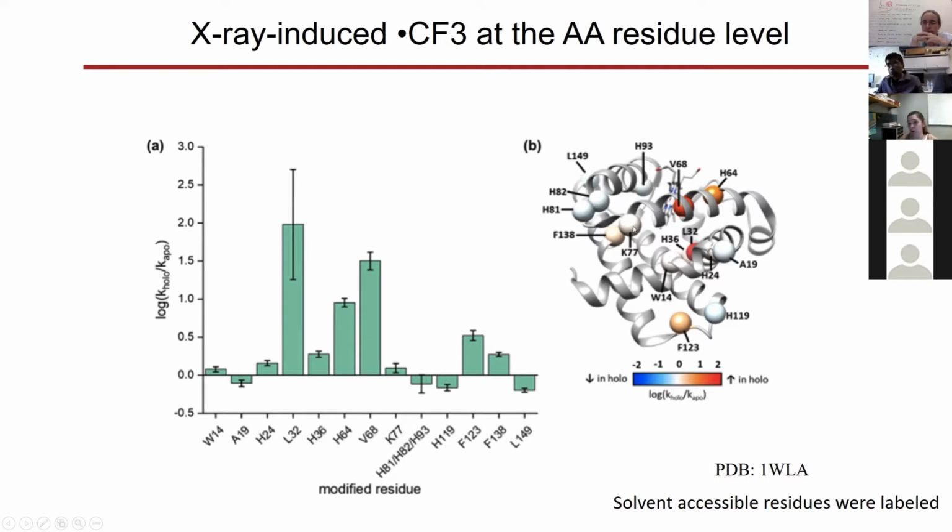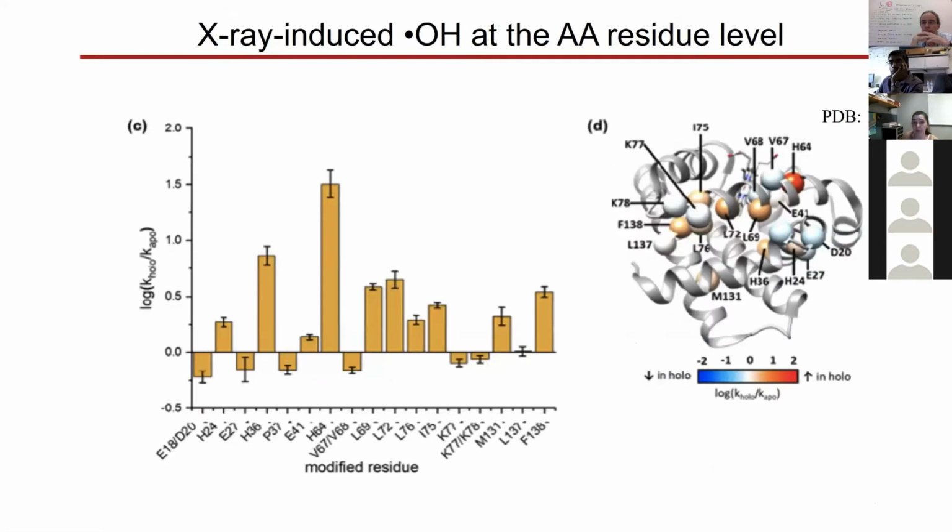So also there are some other peptides we look at here, and the residues we quantify in the vicinity adjacent to this heme pocket were actually showing some increase in labeling, which indicated some conformational rearrangement. The same experiment we did exactly for apo myoglobin and holo myoglobin for hydroxyl radical exposure only.